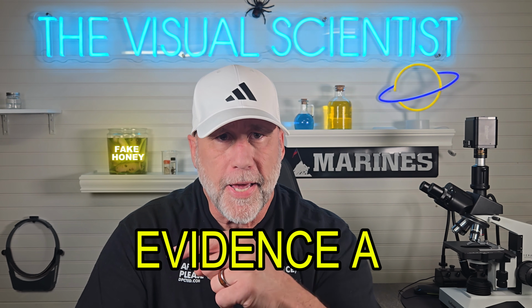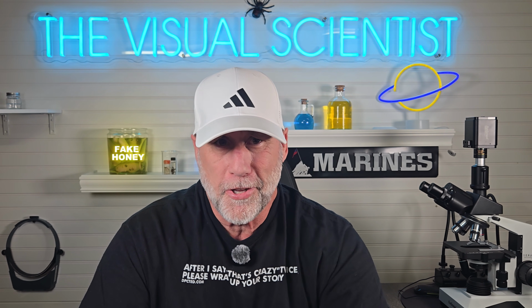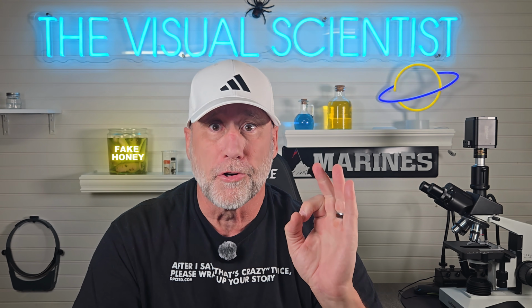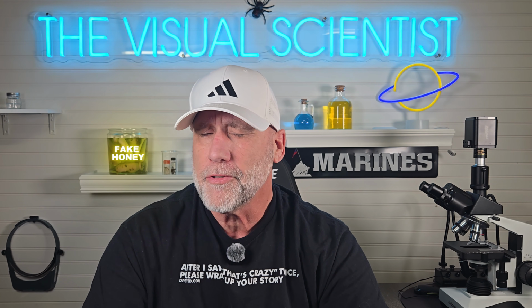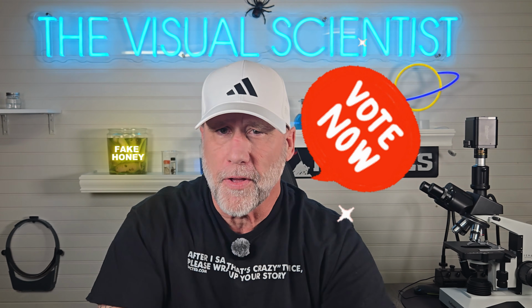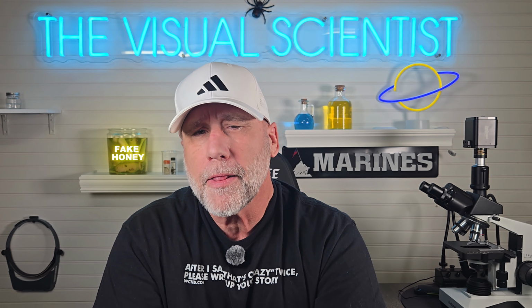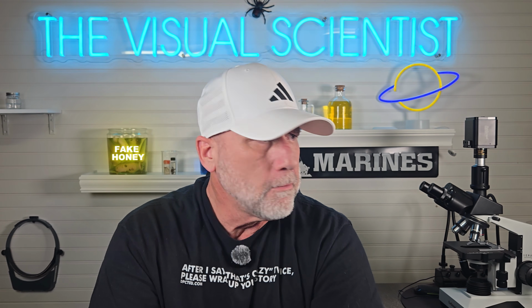I'm calling them evidence A, evidence B, and evidence C. I'm not telling you the brands until we get to the whiteboard, because I want you to watch these slides with zero bias. No brand loyalty, no label trust, just the raw data. Drop your vote in the comments right now, A, B, or C. Which one do you think looks the most different under the microscope? I'll check the votes when we get to the whiteboard.